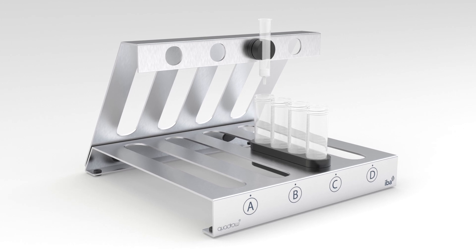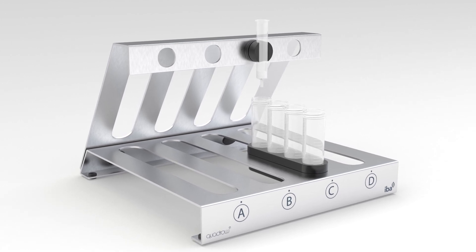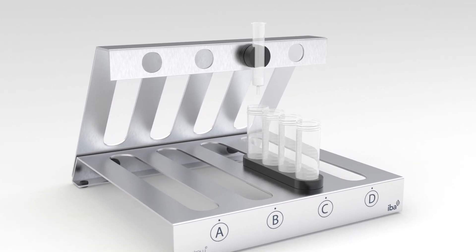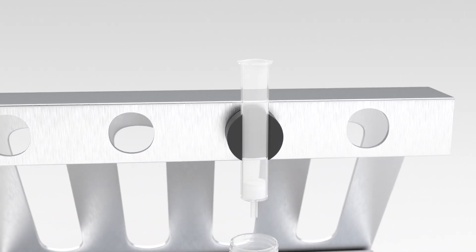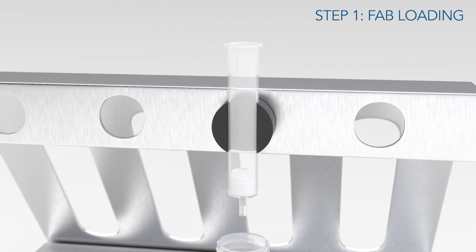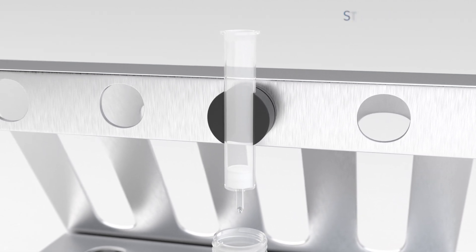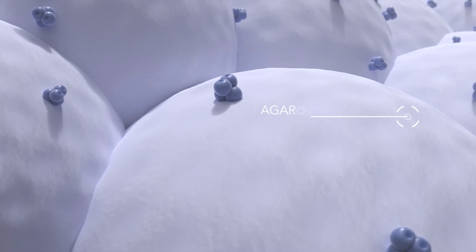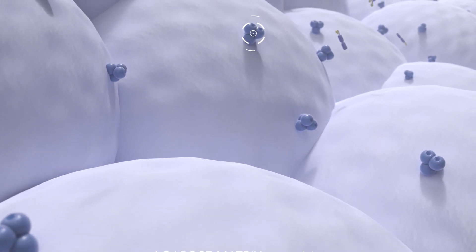TACS comprises an innovative immune affinity chromatography, whereby target cells are captured by cognate fab fragments that are reversibly immobilized on a column matrix via an epitope tag. The fab tax gravity column is filled with a cell-grade agarose coated with Streptactin.